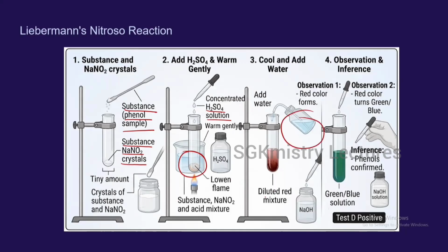So when water is added, you can see it is red in color. Now, when you add NaOH solution to this, you can see that it turns green or blue. When this happens, it is clear that the presence of phenol is confirmed. So let us look into the reaction for the same.